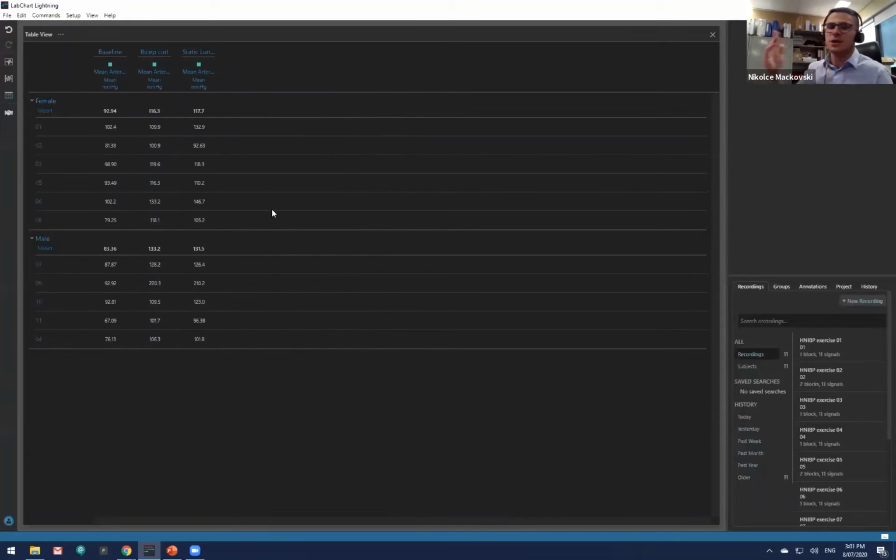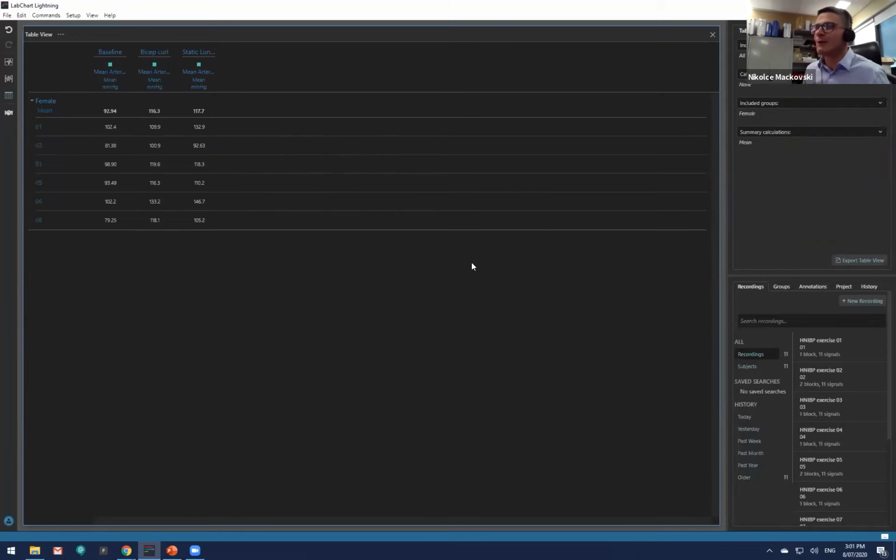And let's just say I was only interested in the females and not the males. If I just click on my properties again, I can choose to remove the male. And now I only have the heart rate, for, well, the mean arterial pressure, my apologies, for females in this exercise here. So it's really handy to have.